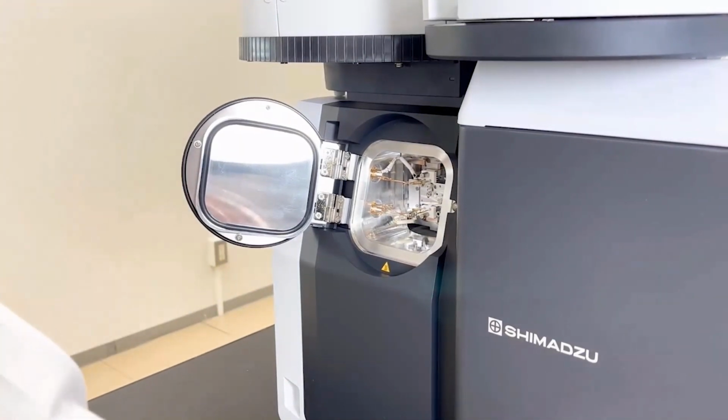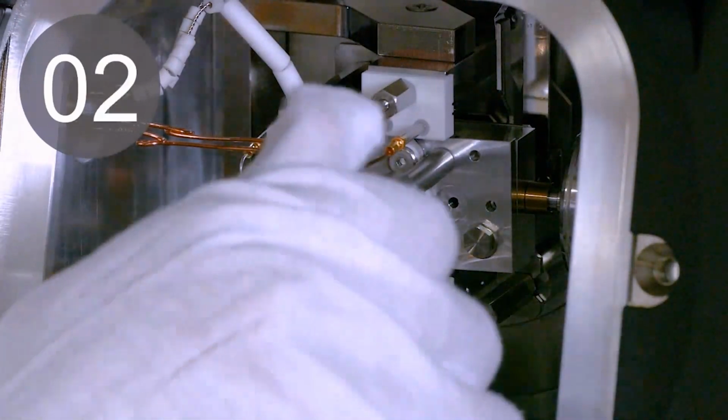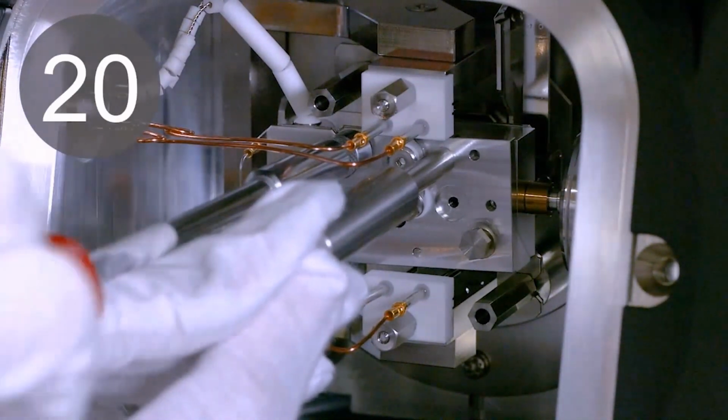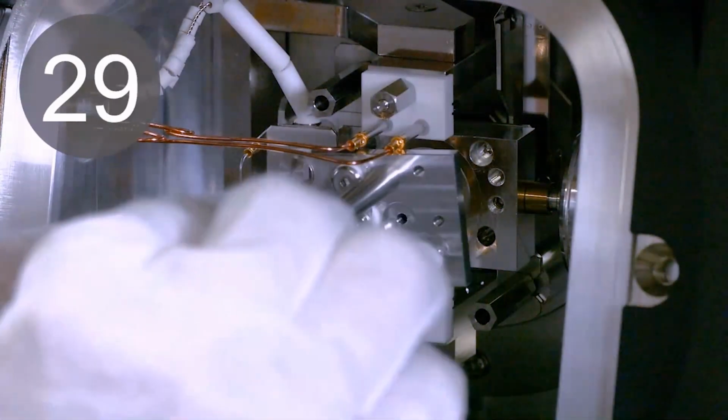That's it. If you have an extra ion source set, you just put in a brand new maintenance ion source instead of the old one, tighten the 2 screws, and remove the tools. That's it. It's completed within 1 minute.